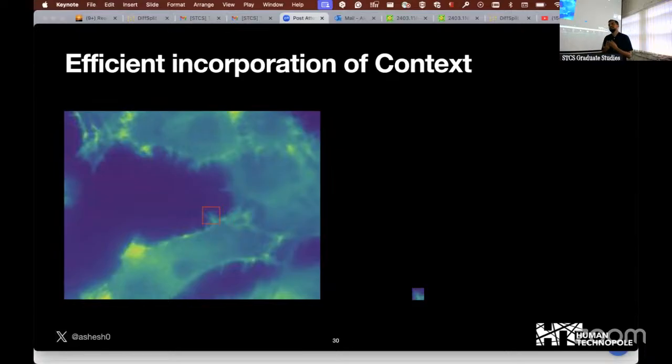So the benefit is that now you don't have a narrow filter. Now you have a broad enough filter, so you could collect more light. So maybe you will come to this, but this will work fine maybe for the physically segregated organelles or whatever constitutes in the cell. But imagine if it's an overlapping sequence. Would this also work? You will come to it. Yes. I have good results. That is what I think.